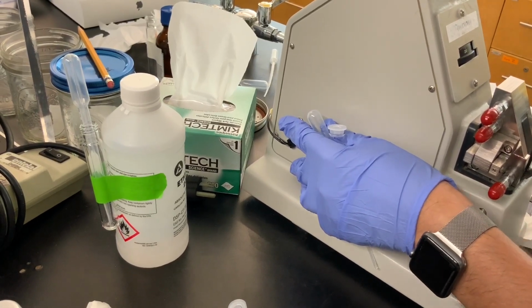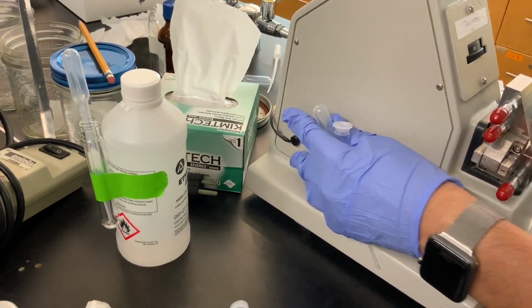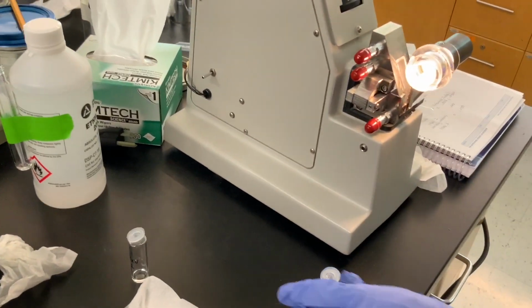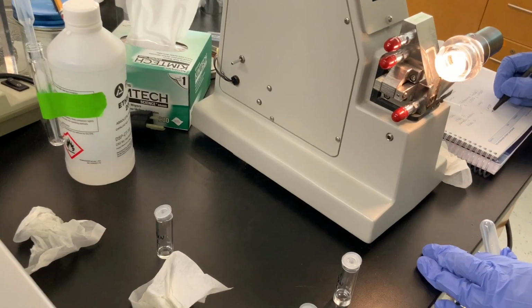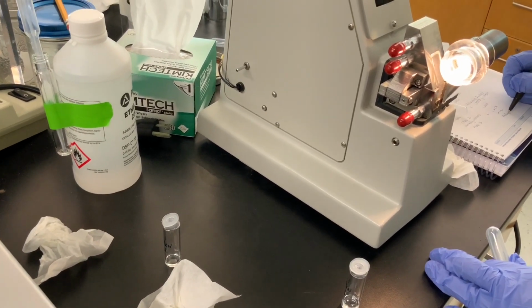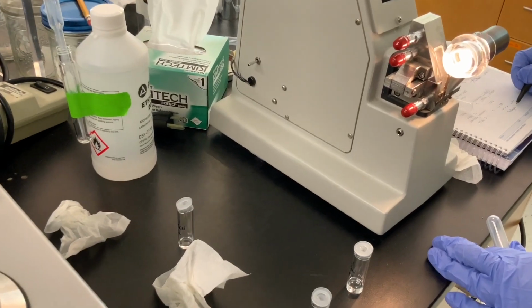That's almost exactly on the spot. That's pretty cool. And so now those are the Abbe readings. And now let's get the digital.